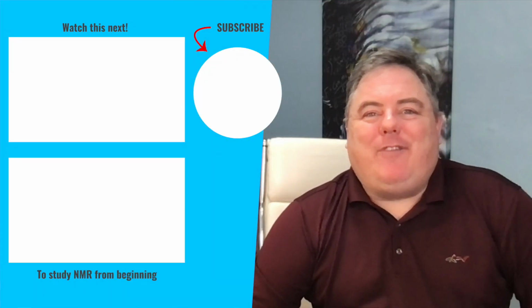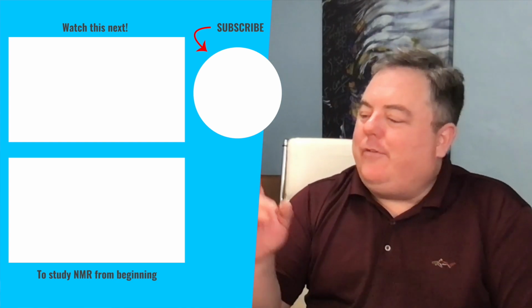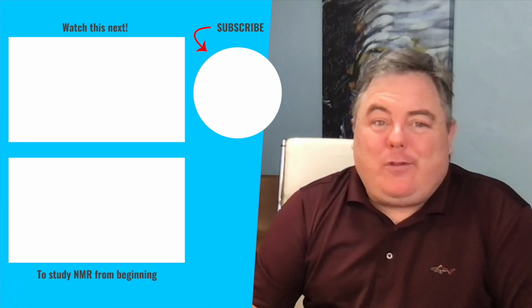I hope that video was helpful for you. That's the basic understanding of carbon NMR. We just look at these single peaks, we count how many we have, and we just learn those 4 regions.